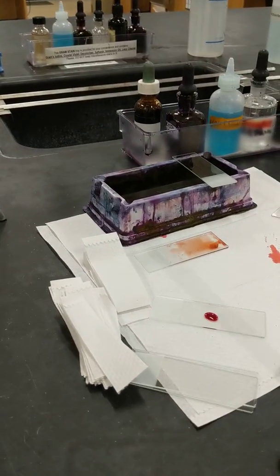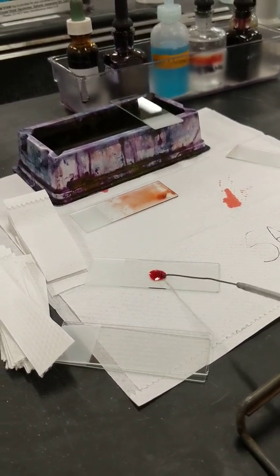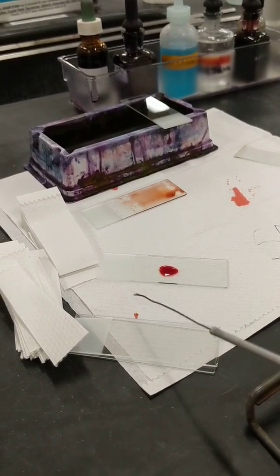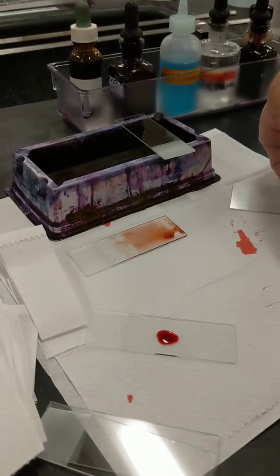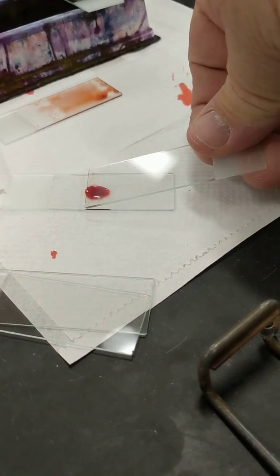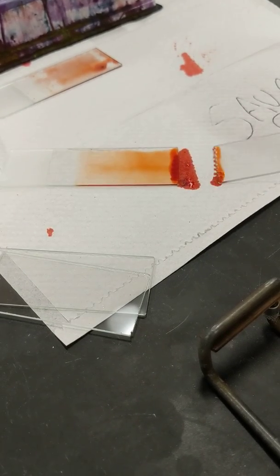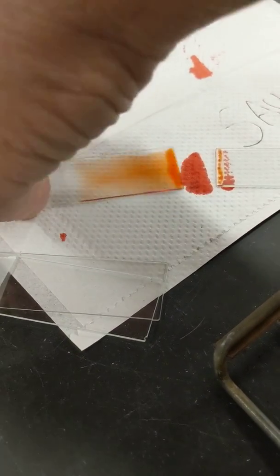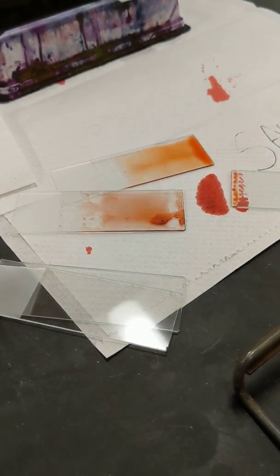You would then take your bacteria and put it into the Congo red and make sure that you mix it up real quick. Then I would recommend that you just touch it on the slide and make a slide, and through the magic of video, here that slide is air dried.